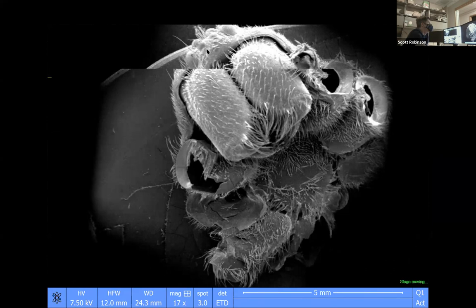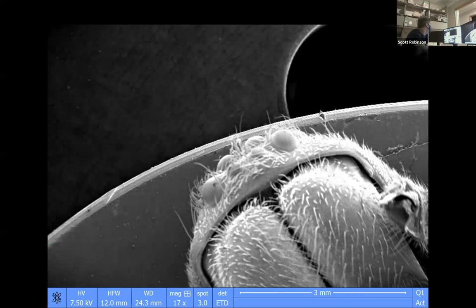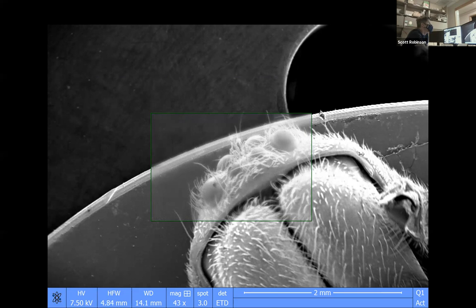This is the front part of the spider? Yeah. I wanted to try to get a better image of it, and I took its legs off, but you can still see the claws very well. See the eyes.